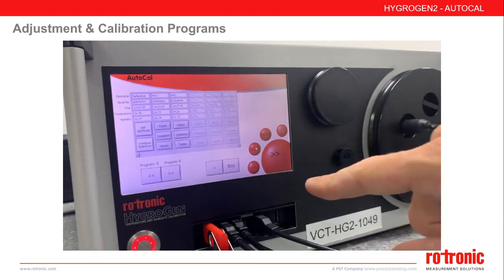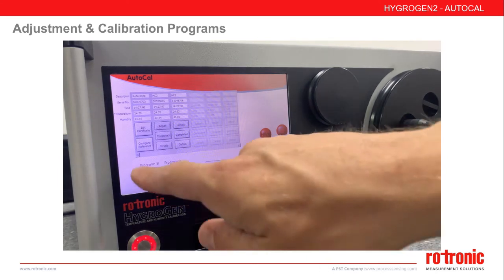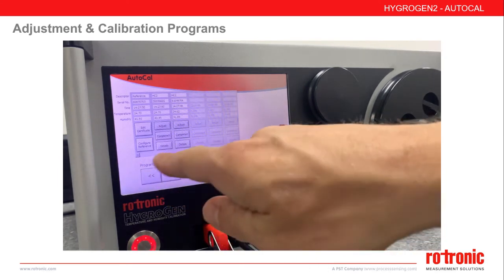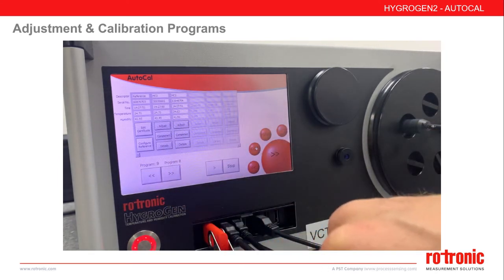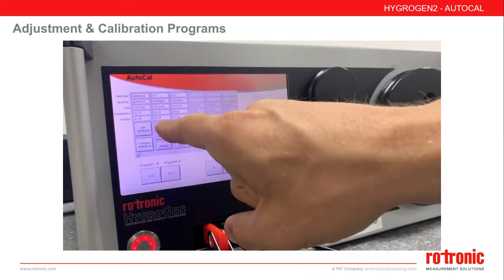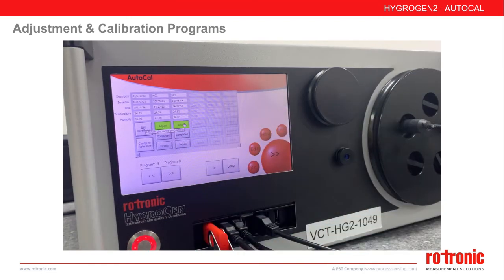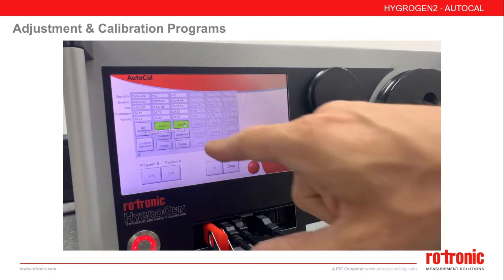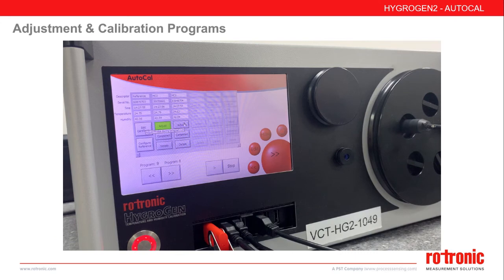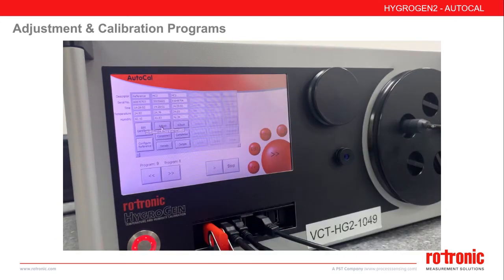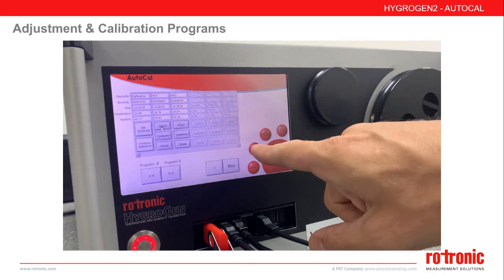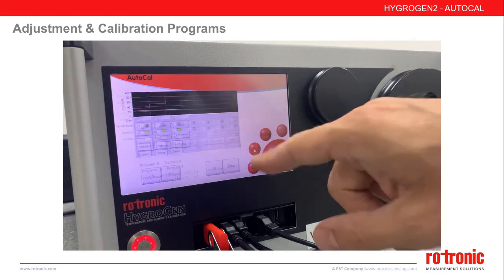To avoid accidentally adjusting your probes, even if you select a program with adjustment points highlighted, you must specifically press the adjust button on each probe. This means you can adjust only one probe during an adjustment run, and also prevents accidental adjustment.